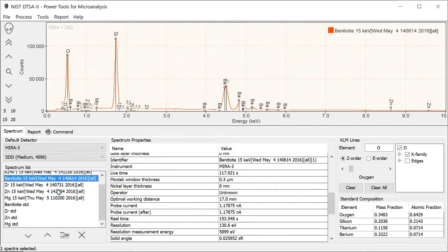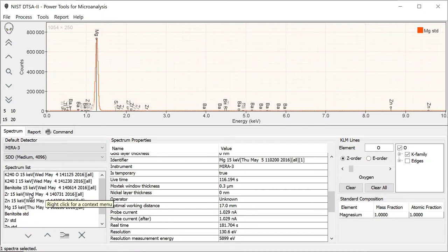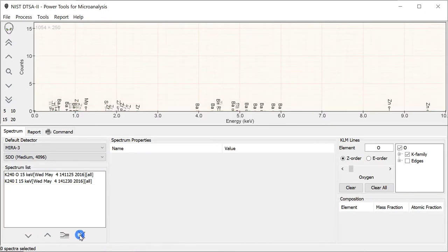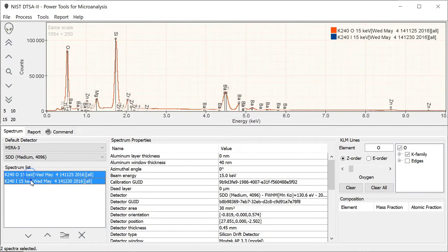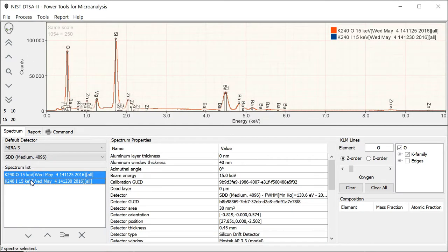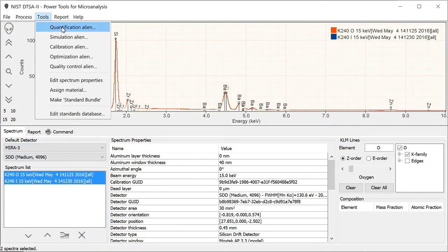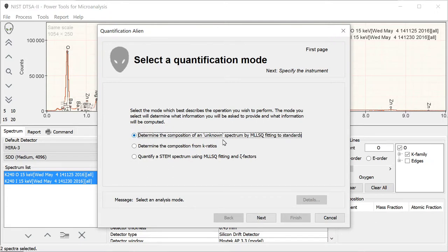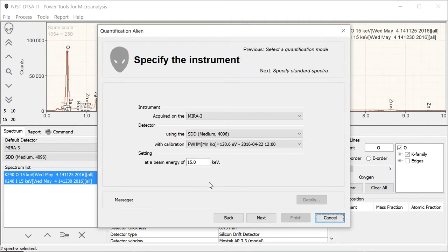We've gone ahead and done that. Now we can actually clear all of these out because we won't be using them directly. We're going to use them off the disk. I select my spectra that I want to quantify. Go up to Tools, QuantAlien, and we're going to select the top option: Determine the composition of an unknown spectrum by MLSQ fitting to standards.